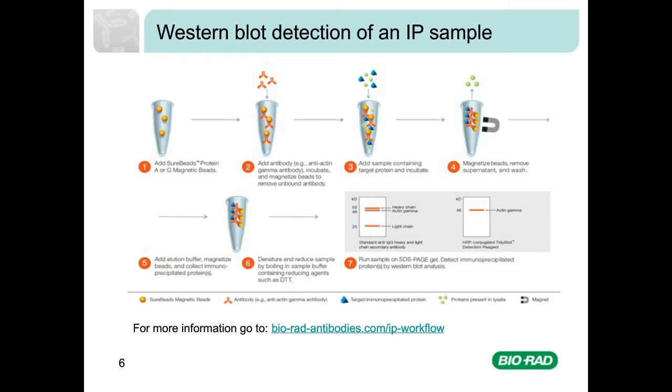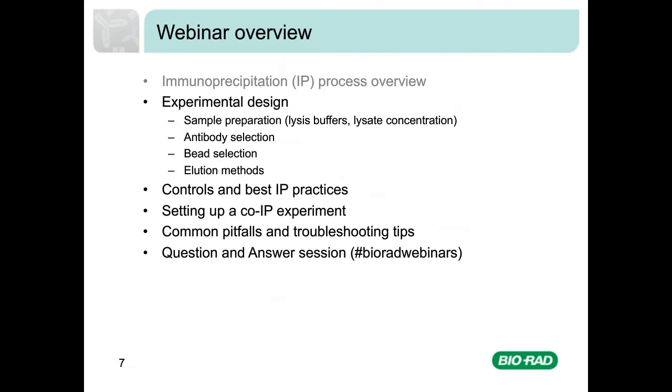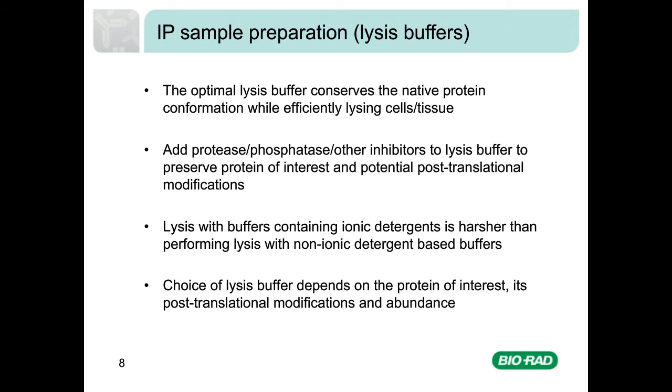I'm now moving on to the experimental design part of the webinar. First, we will discuss the importance of selecting the optimal lysis buffer for preparing samples on which you will perform an IP experiment. What are the criteria for selecting the optimal lysis buffer?